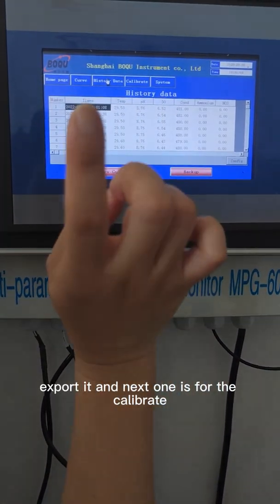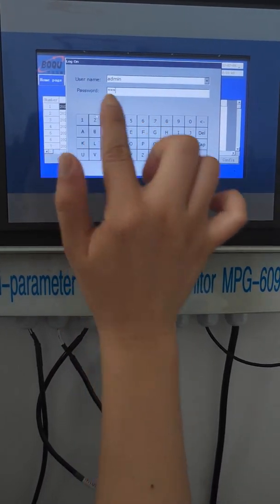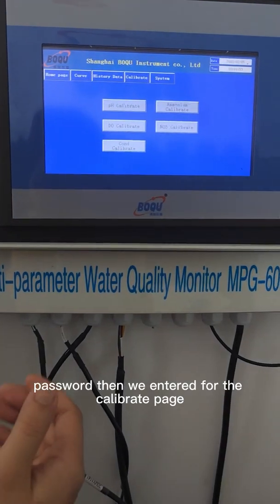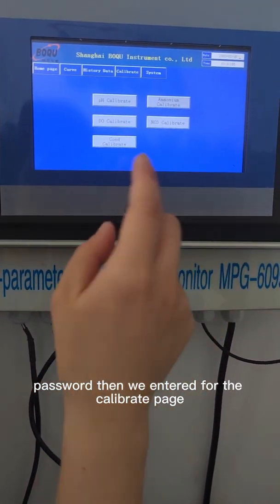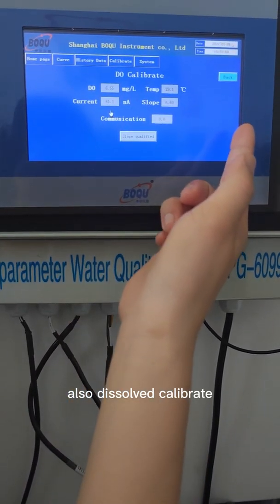Next one is for the calibration. First we input the password, then we enter the calibrate page with pH calibration and dissolved oxygen calibration. All of the sensors' calibration is right here.